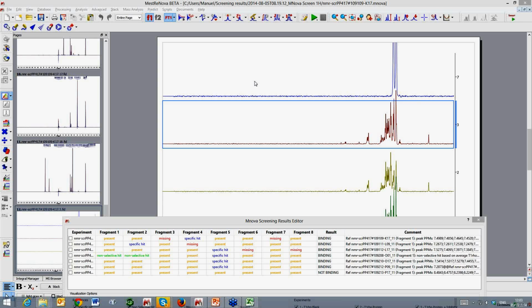Let me think this over for one second, Martin. So Martin is asking if with the matching, we can do this the other way around, looking for situations where the mixture spectrum has changed. Yeah, I don't see why not. Personally, I haven't tried to do it, but at the end of the day, that is what we are doing. The only thing is that at this stage we would tell you only which parts of the spectrum have changed.